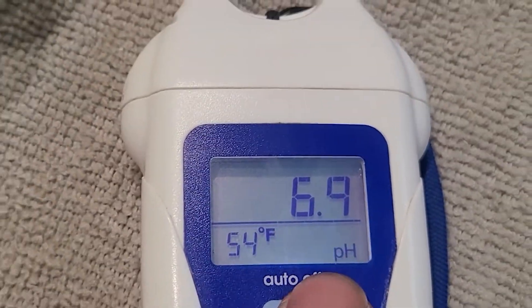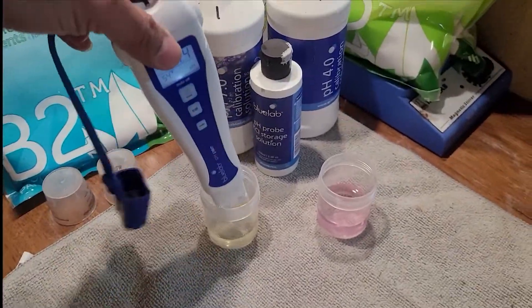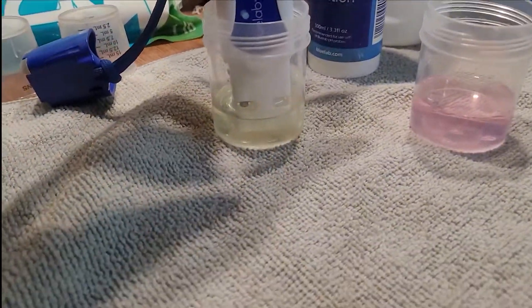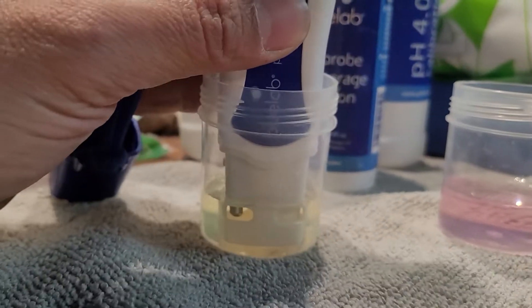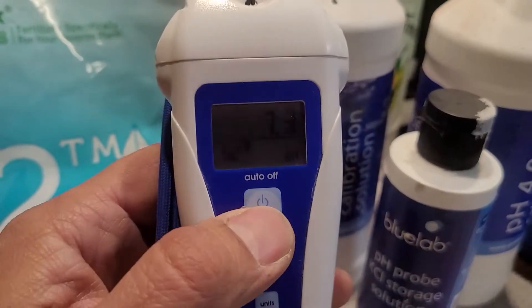So what you want to do is turn it on — see there's no check mark; there's supposed to be a check mark next to the pH. This is the number one, the pH 7 solution. Just dip it in there and make sure the probe is covered. There's a little glass ball in there — make sure all of that is covered up.